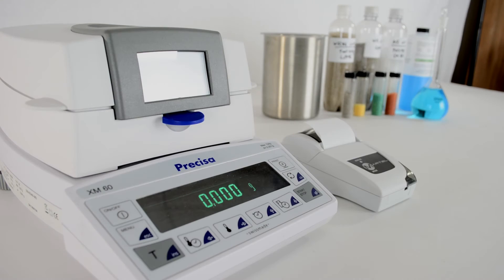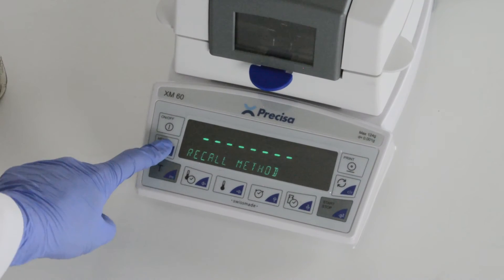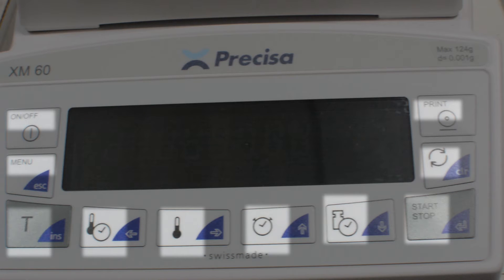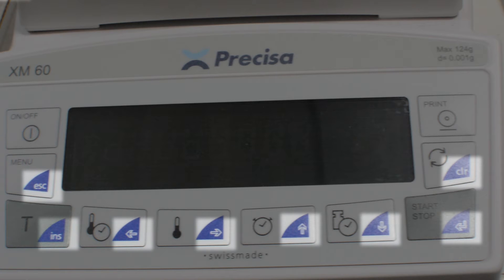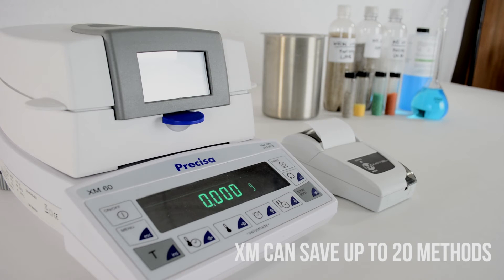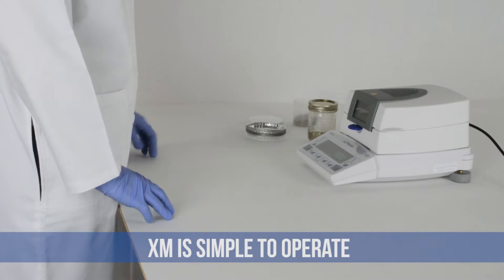Now let's discuss what sets the XM and the EM apart from each other. The XM navigates its menu using multi-purpose keys. The icon on the left corresponds to the menu or function it serves. The blue segment of the buttons are the keys to navigate the interface once you've chosen a menu. You can set up and save up to 20 heating methods on the balance. Once you have your method created, operation of the XM is simple.